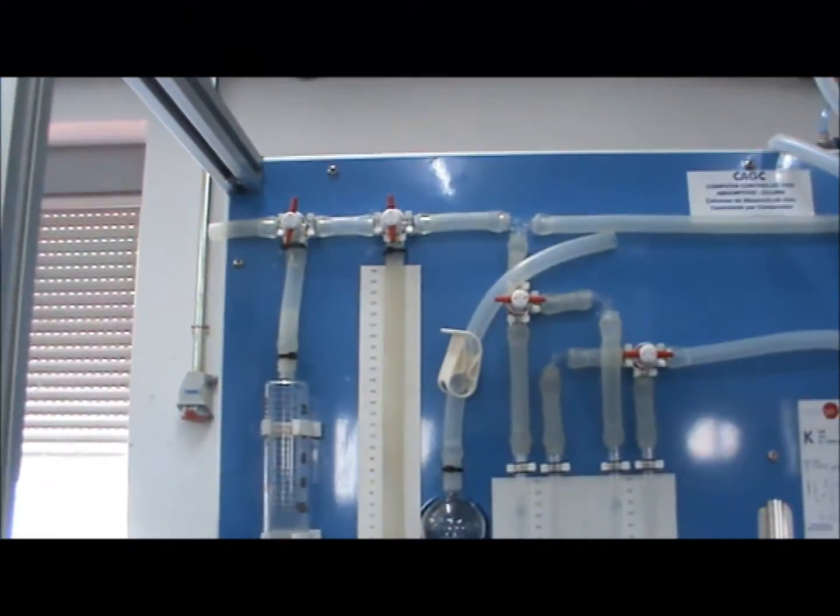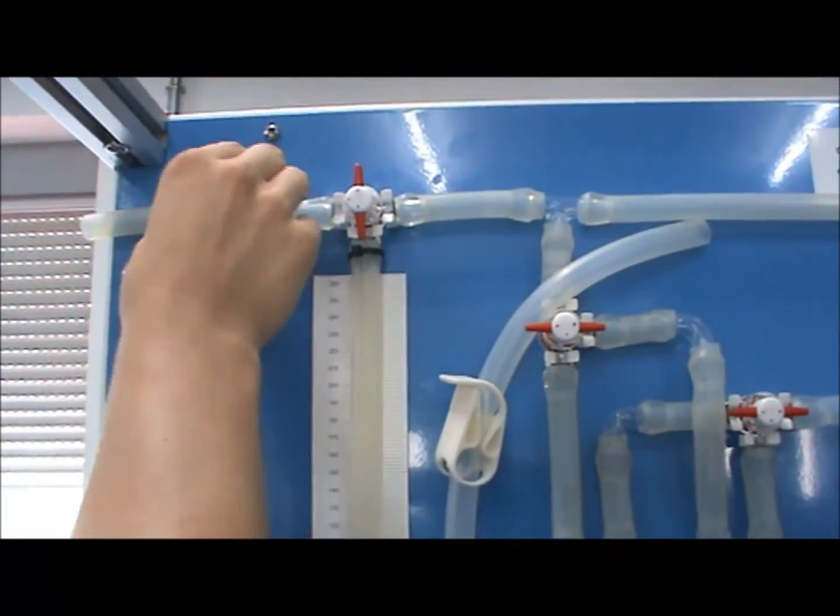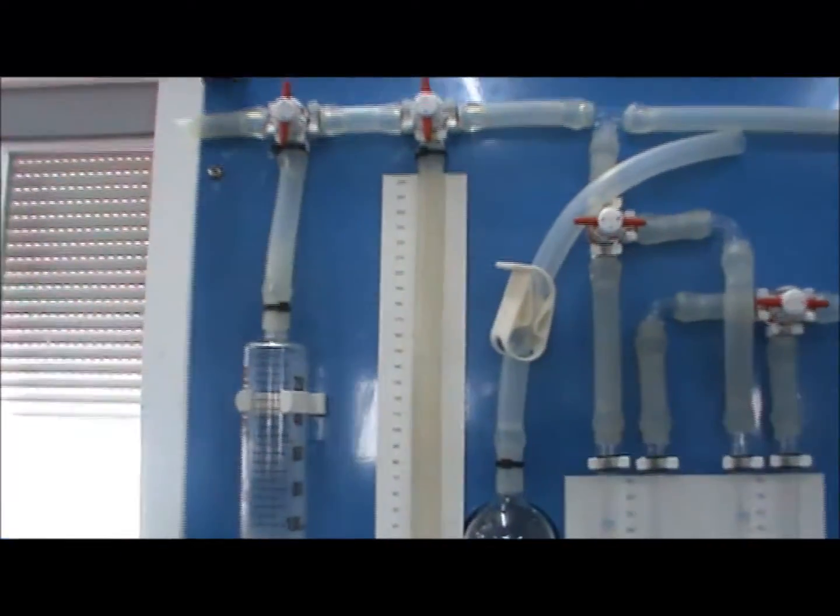Repeat by first closing VT3 and expelling the air to the atmosphere. Make sure the solution rises to a level somewhere within the measured range below valve VT2.